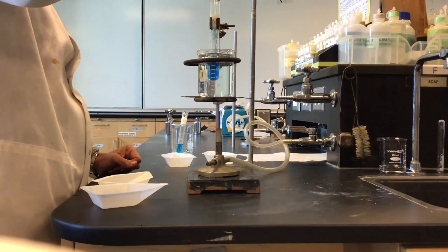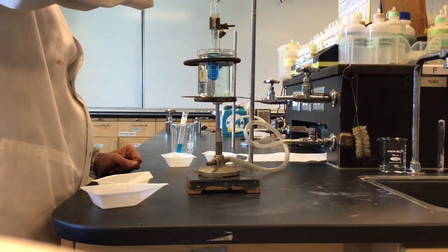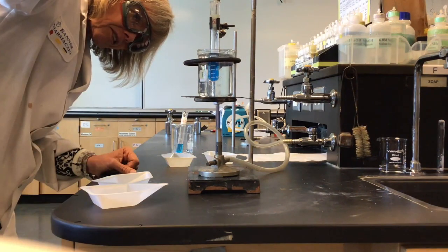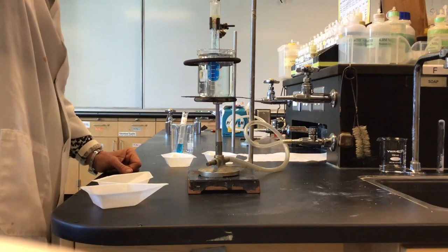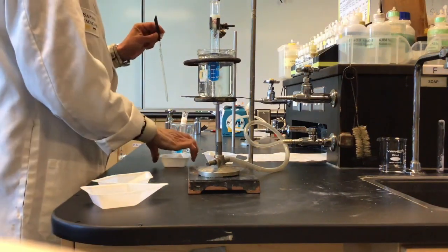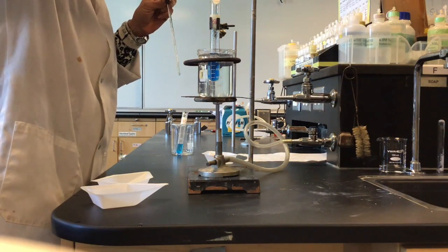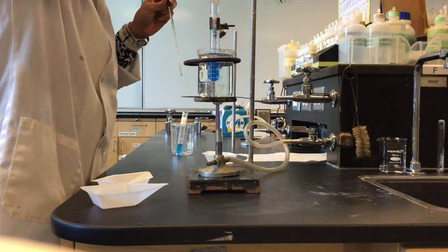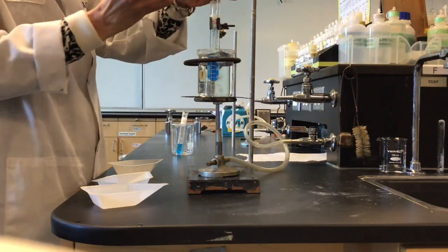Looks like it's getting a little bit harder to dissolve our copper sulfate pentahydrate. We're getting to that point of saturating our solution when you can no longer add any more. I think I just dissolved our last piece. All right, let's try number 10. Must be getting close. Again, number 11. This has to be the magic number.